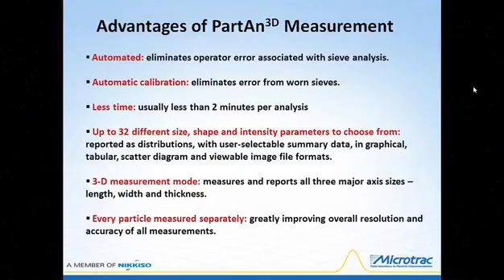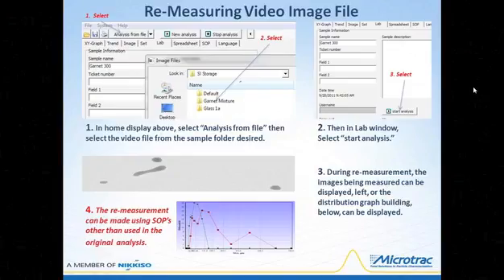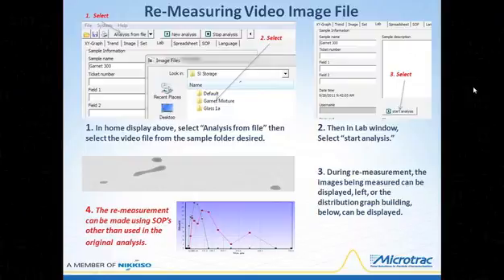The Partan 3D analyzer is also the only image analyzer with a 3D mode and a patented algorithm. It reports the size of all three major axes: length, width, and thickness. This 3D mode provides much more accurate morphological data than any 2D image analyzer. We can re-measure any saved video file, allowing testing of different post-analysis SOP settings. This provides a very convenient method of continuous refinement of the SOP to use for quality control or process control objectives.